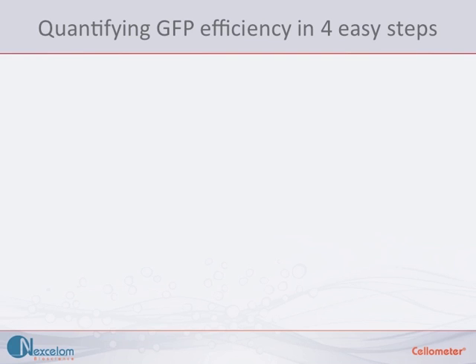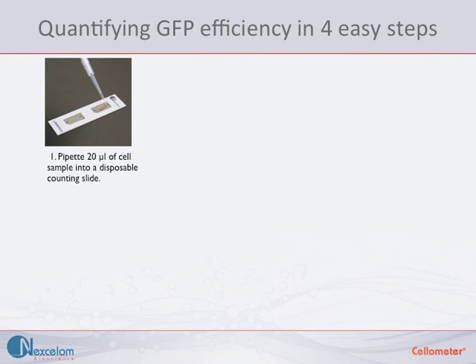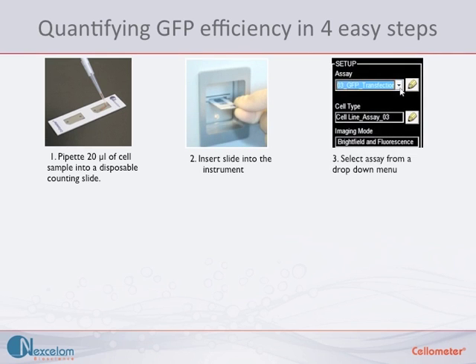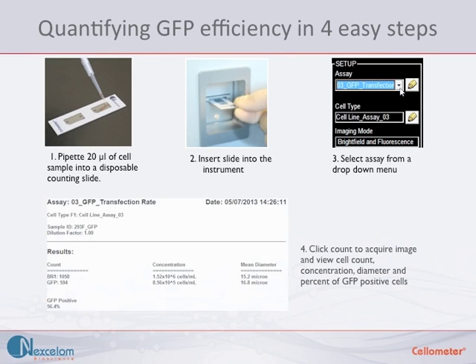Quantifying GFP can be done in four easy steps. First, pipette 20 microliters of cell sample into a disposable counting chamber. Then insert the slide into the instrument, select your assay from the drop-down menu, and click count. Within seconds, the instrument acquires images, identifies the cells with and without fluorescence, and automatically tabulates the results.